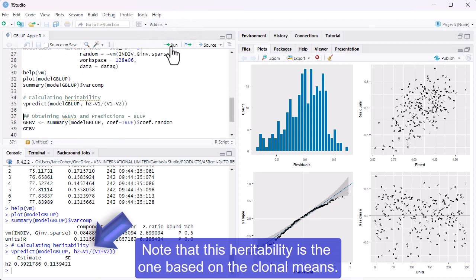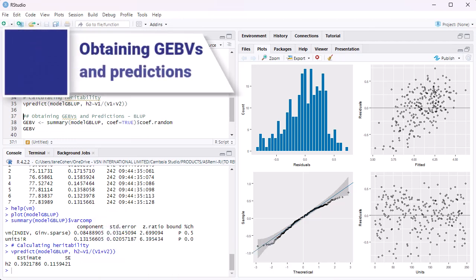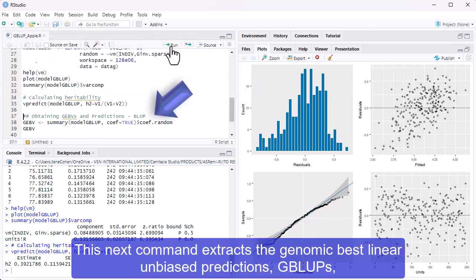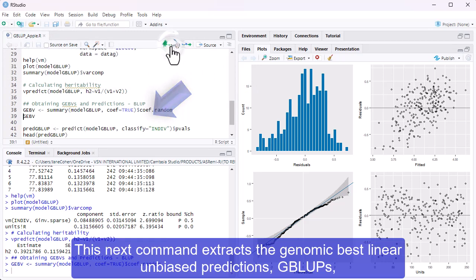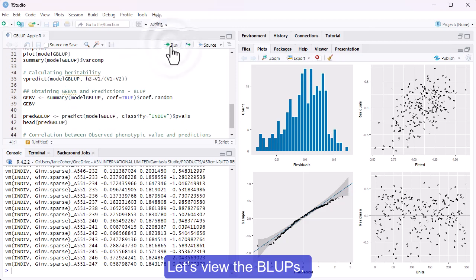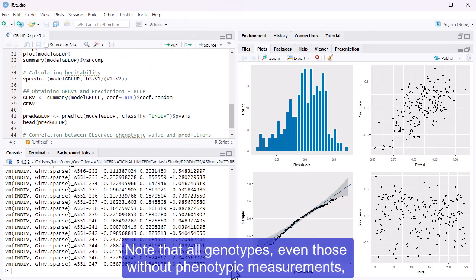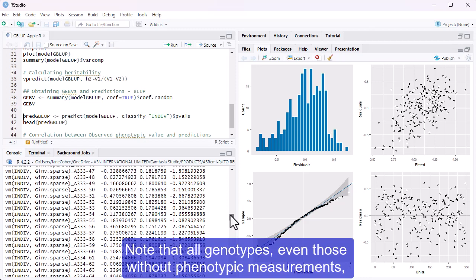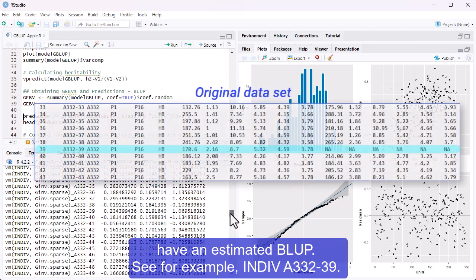This next command extracts the genomic best linear unbiased predictions, GBLUPs, or genomic estimated breeding values, GEBVs, and saves them in an object called GEBV. Let's view the BLUPs. Note that all genotypes, even those without phenotypic measurements, have an estimated BLUP. See, for example, INDIV a332-39.